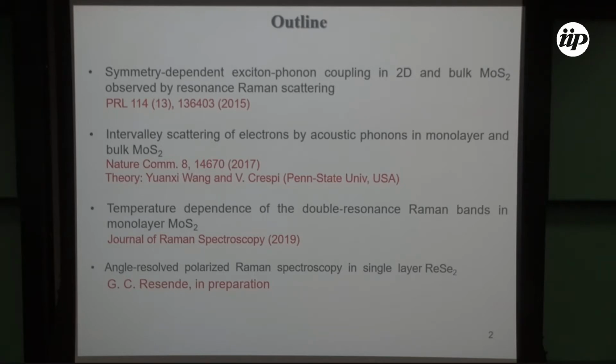The paper is actually in preparation. The motivation to show these results is from last week, where Eric Popper was mentioning some issues that we find in the literature. Here, we are trying to demonstrate that you need to do your polarized Raman correctly in this kind of sample.